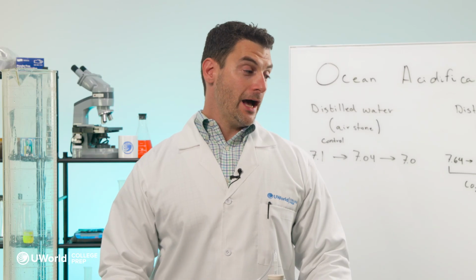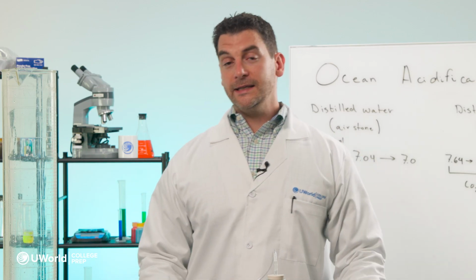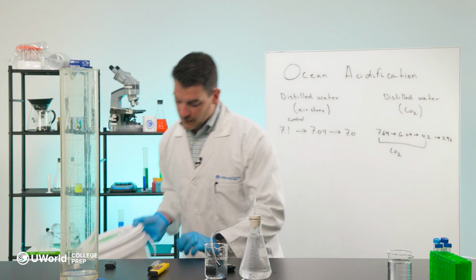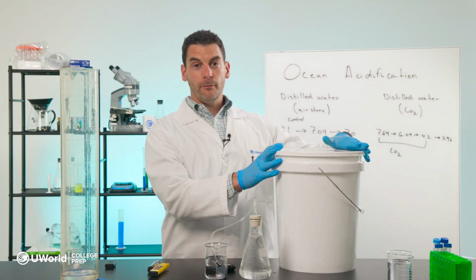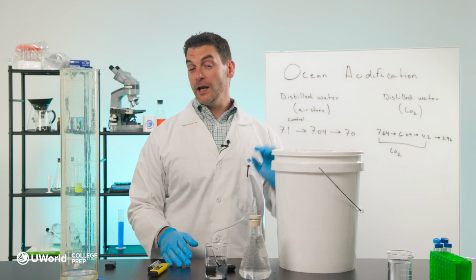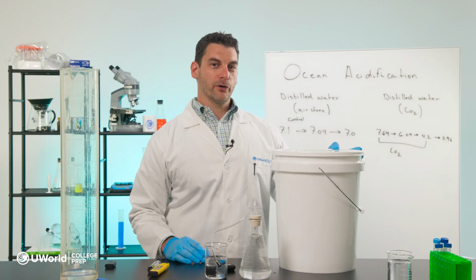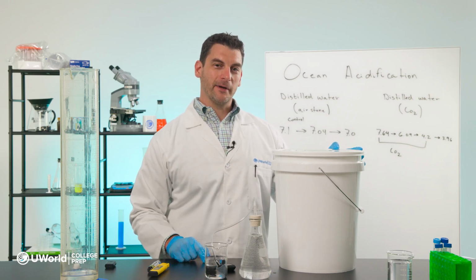So now that we have our baselines using distilled water, we can repeat these same experiments using our salt water. And this is the salt water I created earlier, and it's going to mimic the ocean water. So any changes that we see theoretically in our lab will be similar to those that happen out into the real world. So stay tuned while I clean this up and set up the next experiments.